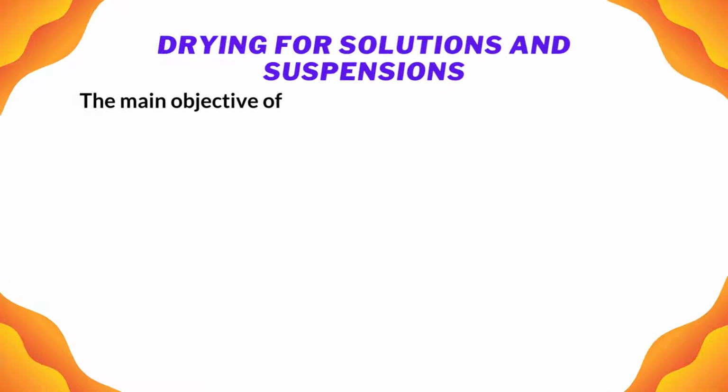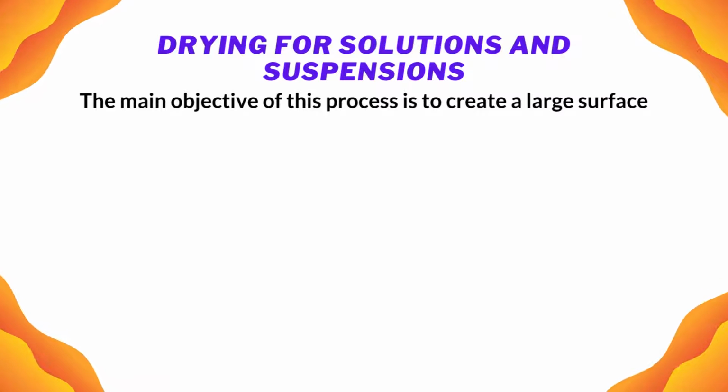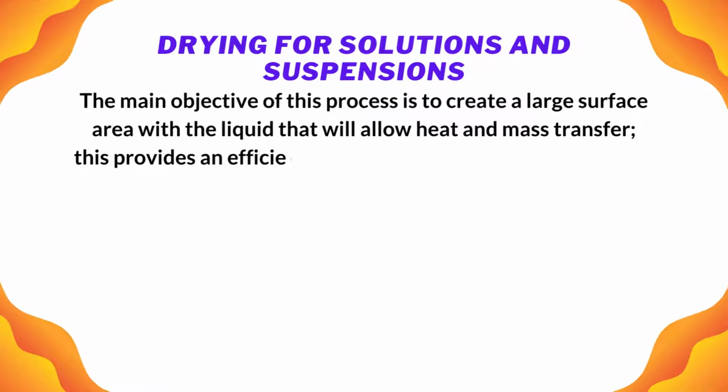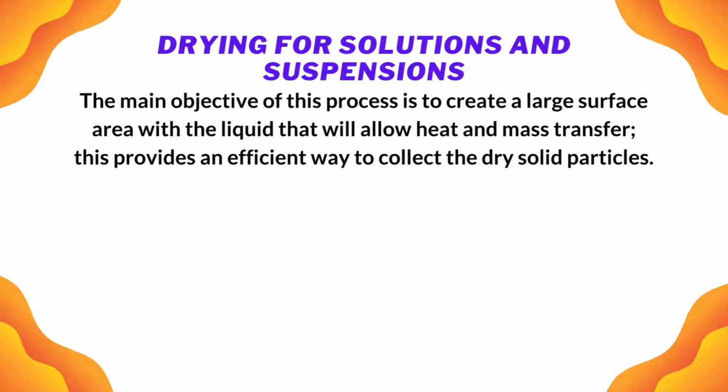Drying for solutions and suspensions. The main objective of this process is to create a large surface area with the liquid that will allow heat and mass transfer. This provides an efficient way to collect the dry solid particles.